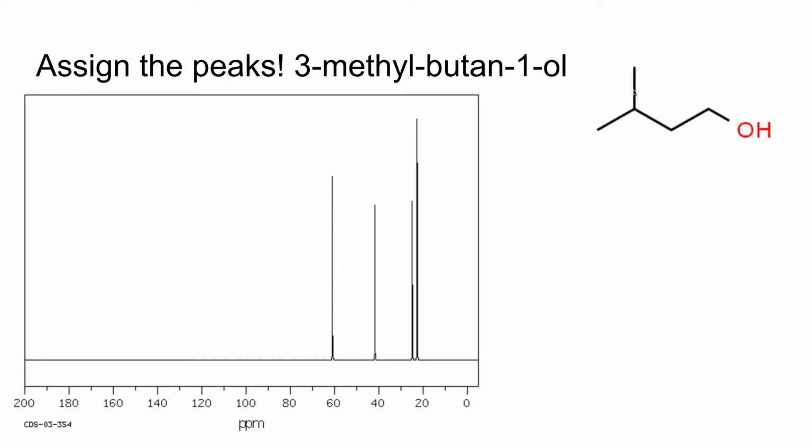This is the peak here at 25 ppm, and then the peak around 20 ppm. It's a bit higher, and that's why I was saying last lesson that the height of the peak doesn't really matter, but it actually kind of does because the height of the peak is influenced by how many carbons are within that environment. So a higher peak tells you there's probably more carbons in that environment. The 2 terminal carbons here are causing this peak around 20 ppm. They're the ones furthest away from the OH group, feeling the effects of that deshielding the least.